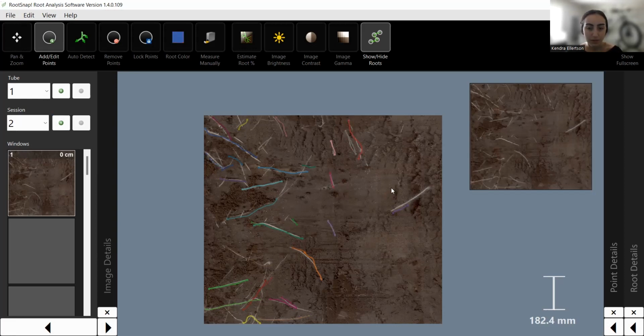Okay. And I'm going to delete this one down here and just kind of redo that.